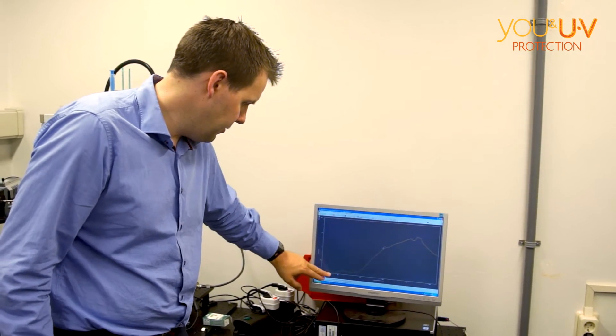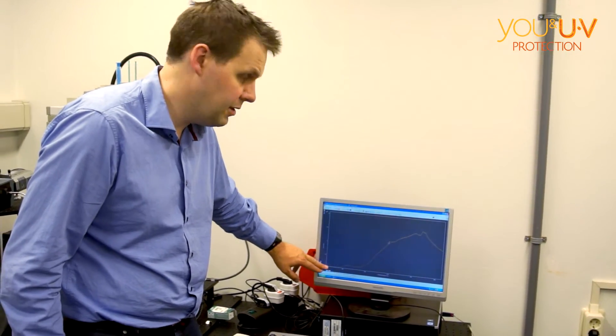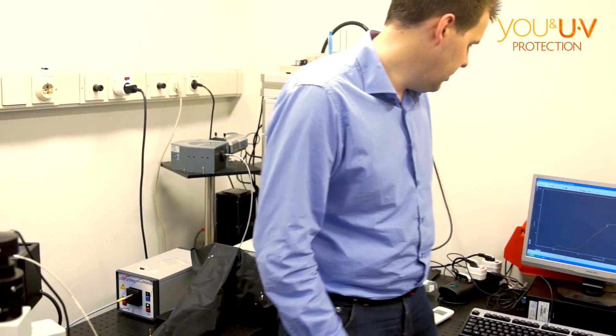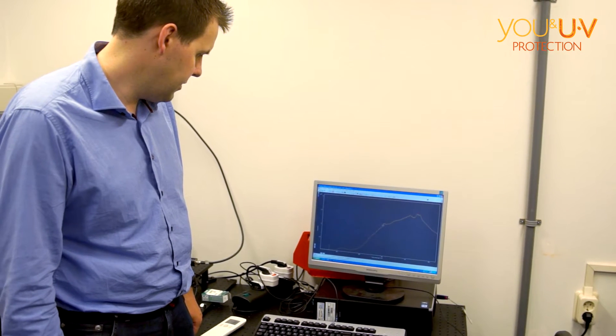This sort of lamp is very useless for the tests that you want to do, because you want to look in the UVA, UVB region, which is down here. So to deal with that, we turn on a different lamp, which is a deuterium lamp.